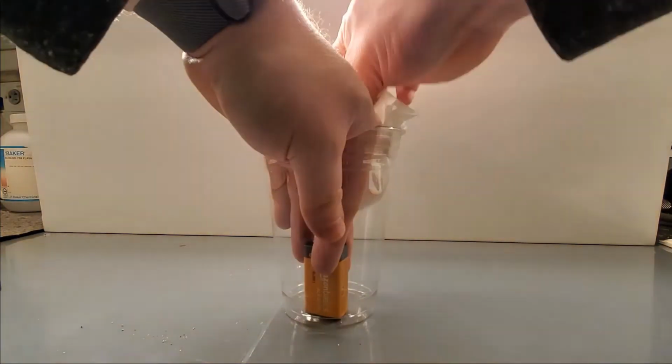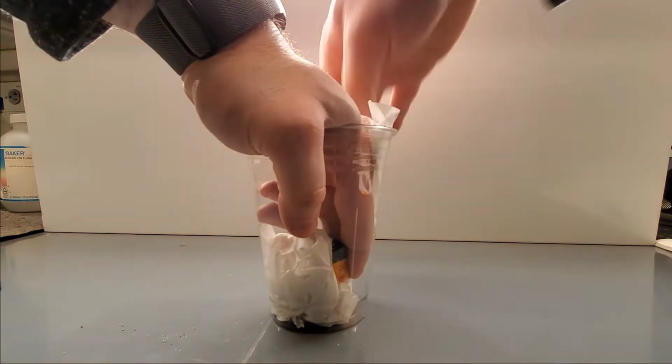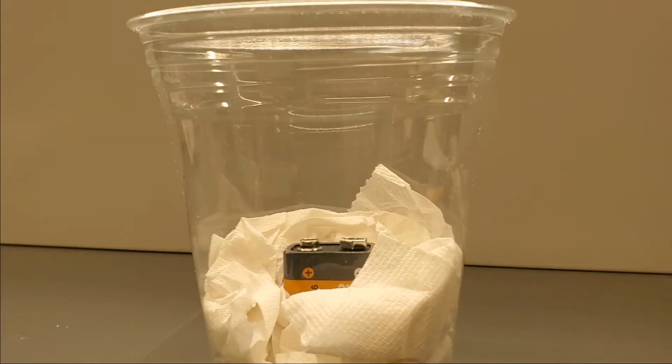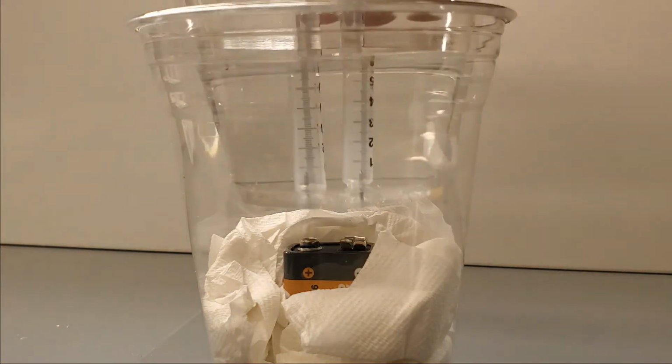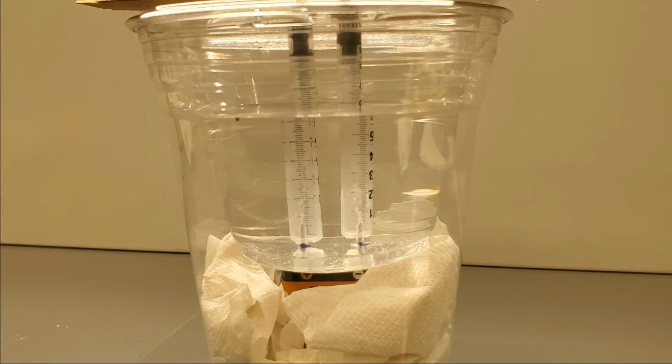Place the battery in the larger cup and use paper towel to try to pack it in place so that it remains snug and does not move during the experiment. Place the smaller cup inside of the larger cup such that the thumbtacks touch the terminals of the 9-volt battery. You should immediately start to see bubbles forming inside of the syringes.